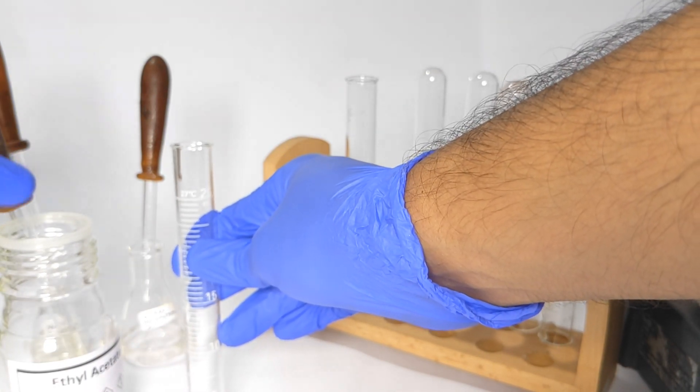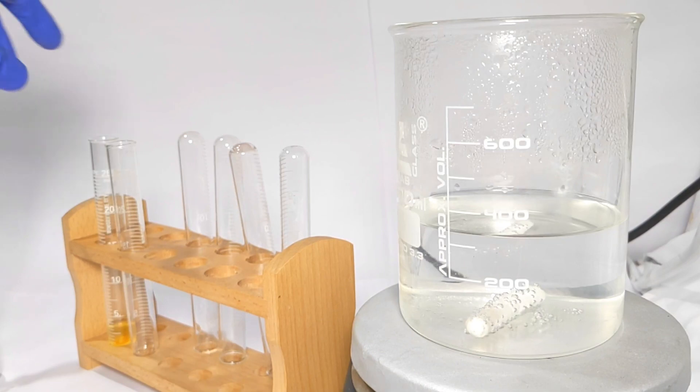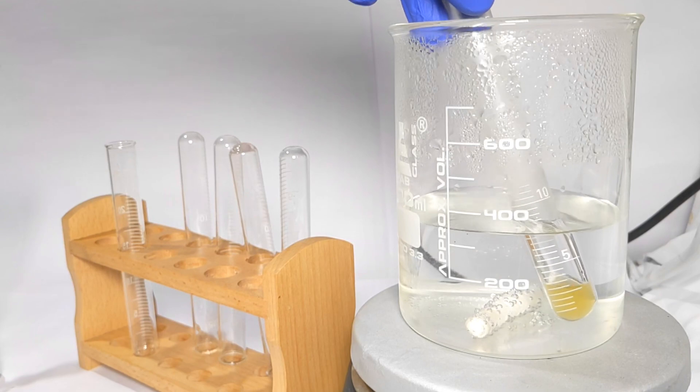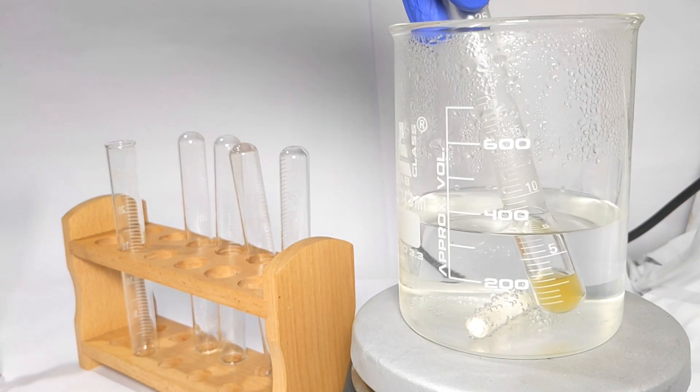Now place the test tube in a boiling water bath for about 30 seconds. This will complete the reaction resulting in the formation of a salt of hydroxamic acid.